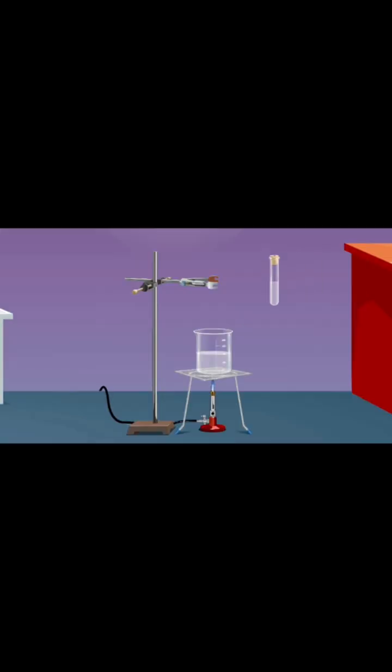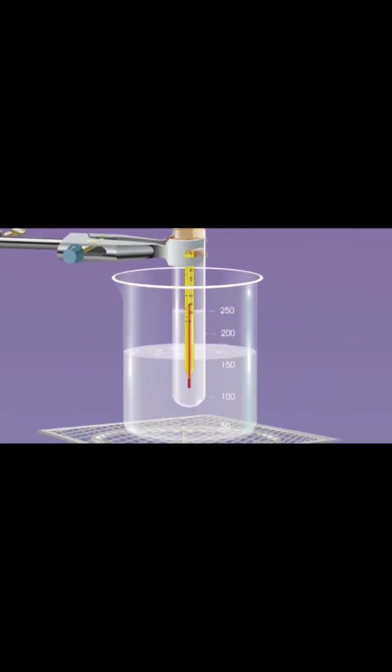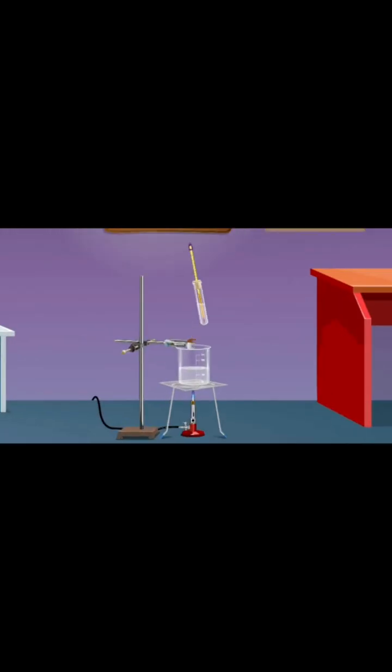You place it on a wire gauge and from the bottom using a Bunsen burner, heating is done. This mixture that we have prepared is placed in this beaker and the temperature is noted with the help of a thermometer. You heat this mixture up to a temperature of around 60 degrees centigrade.